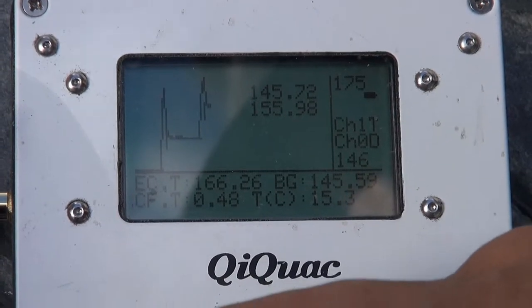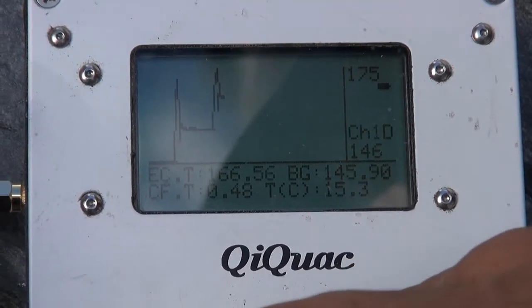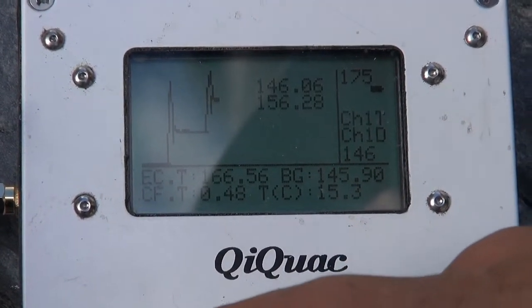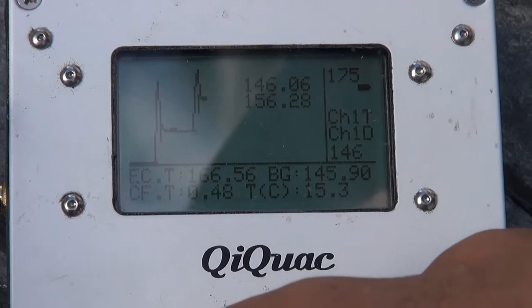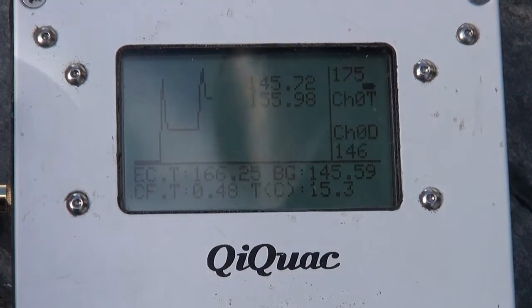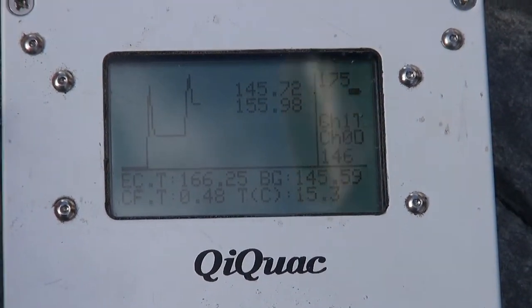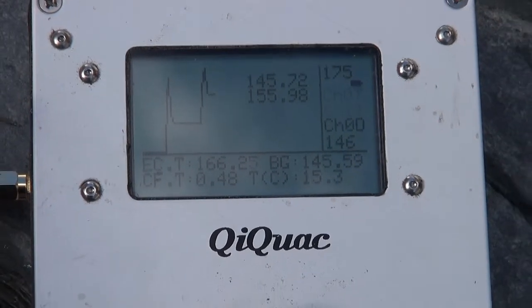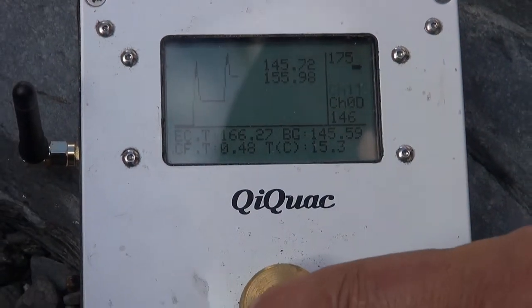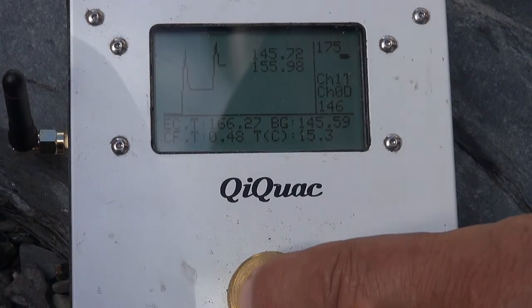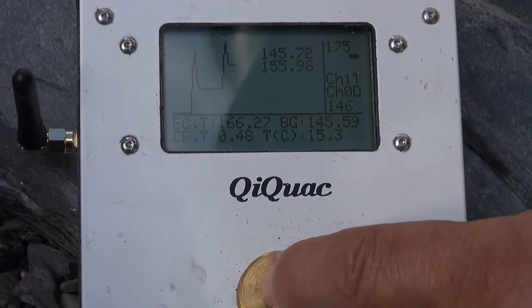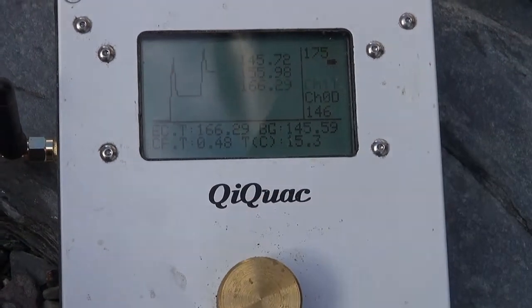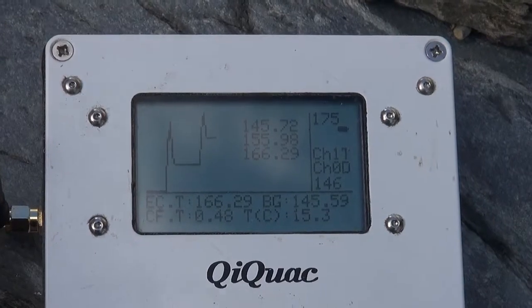166.26, 166.56. Okay, so that's pretty steady. So we'll accept that by pressing it once, that's our next reading.